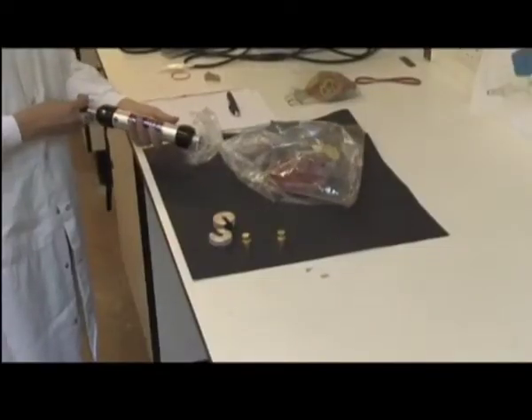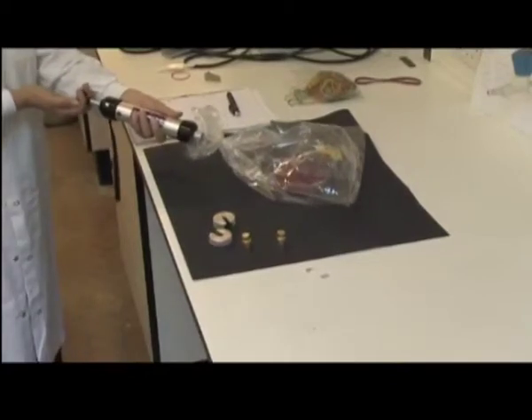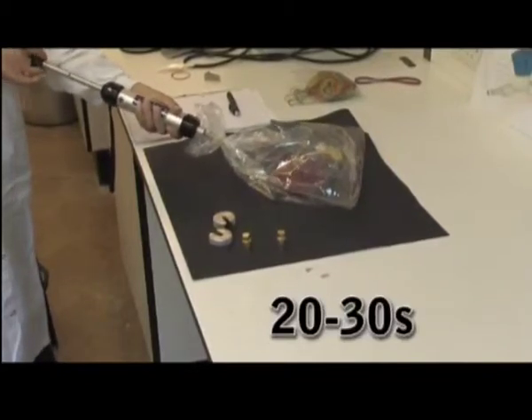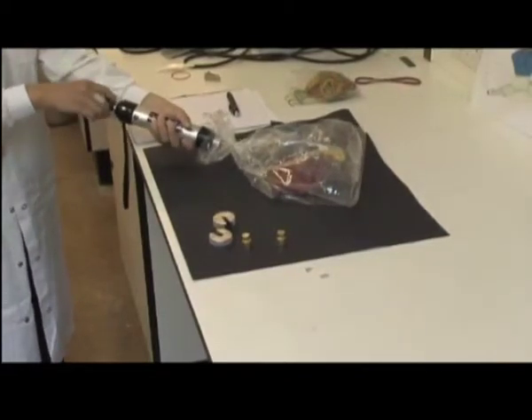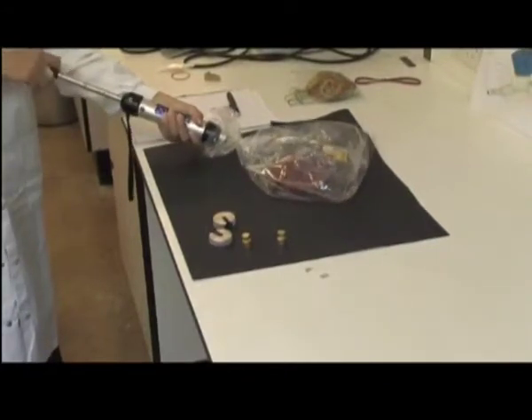Pull the handle back slowly once. Wait about 20 to 30 seconds before turning the handle a quarter turn and pushing it back. Repeat the pump stroke to sample a total of 200 milliliters of headspace.